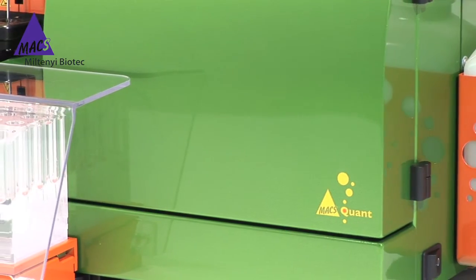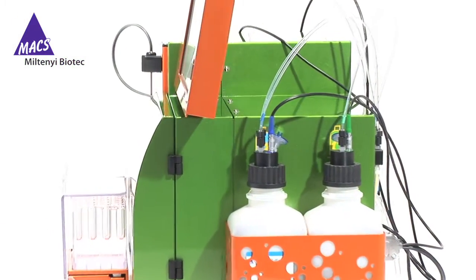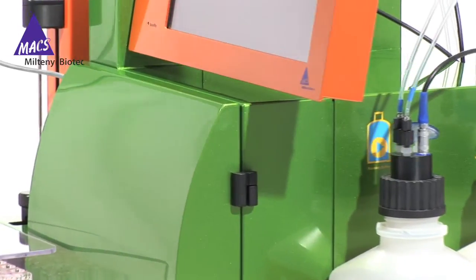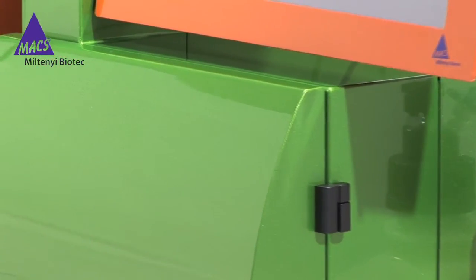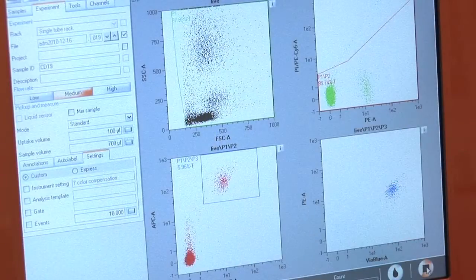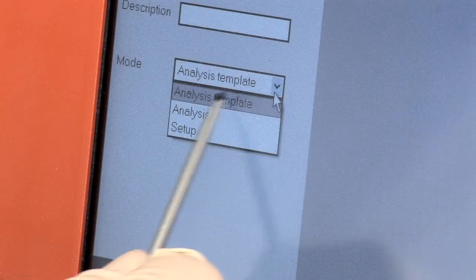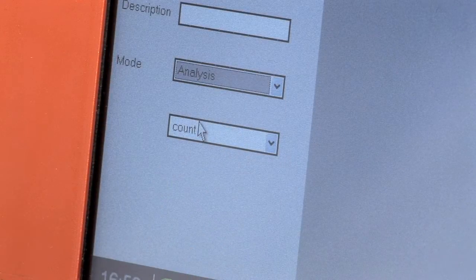Compact in size yet powerful in performance, these best-in-class flow cytometers offer many outstanding features. The robust optical bench allows you to perform sophisticated multi-parameter cell analysis using three lasers and up to ten optical channels. Generate accurate volumetric absolute cell counts you can trust.